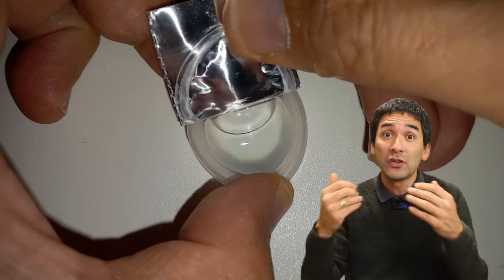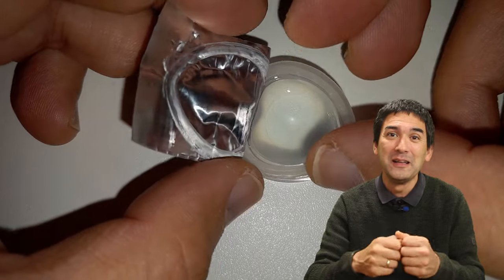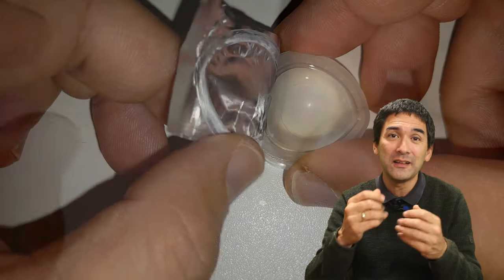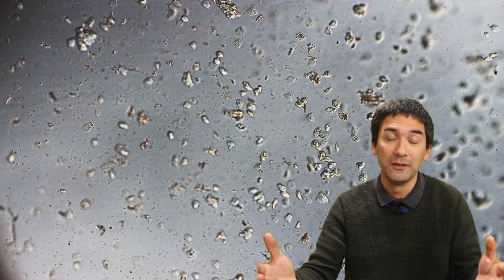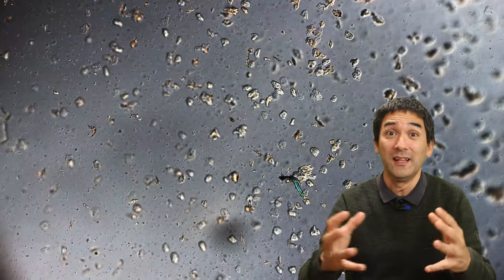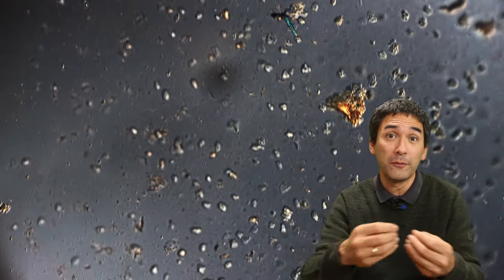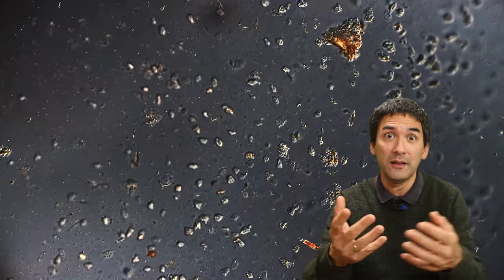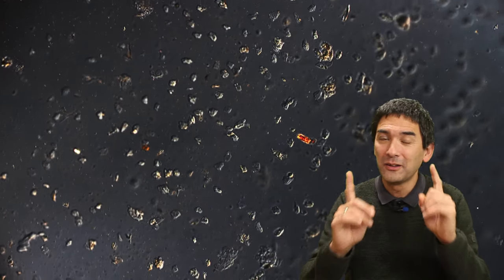So how does a new contact lens look like? I've taken it out and carefully put it on a microscope slide and I wanted to compare and see if it looks cleaner. This is what I got - look at this, I mean it's even worse. What in the world is going on? These are all cells. I just took it out from a freshly opened package and it looks dirty. I was really confused at the beginning.